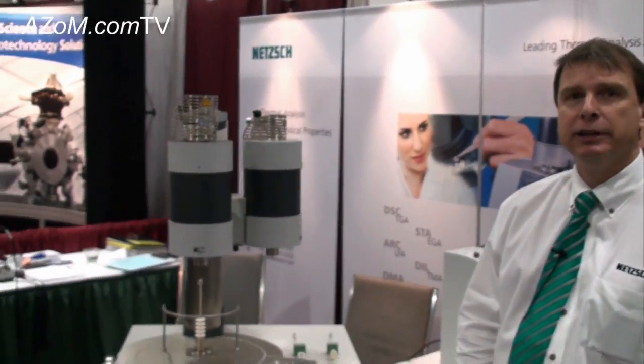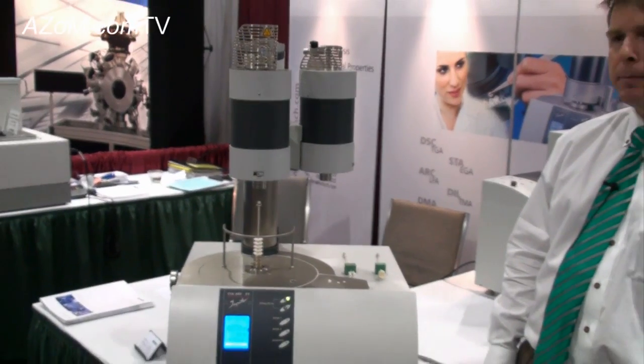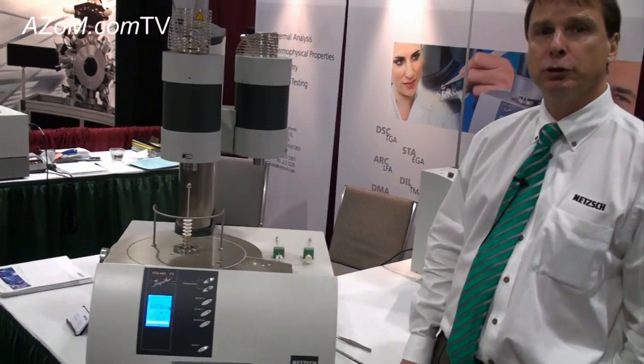This is Cameron Chai from Azom, and today I'm speaking to Dave Sheppard from NETZSCH Instruments. He's going to be telling us about their STA449F1, which is a simultaneous thermogravimetric analyzer and differential scanning calorimeter. So we are measuring both the mass change of a material and also whether it gives off or absorbs energy.